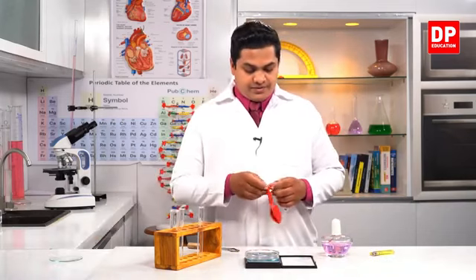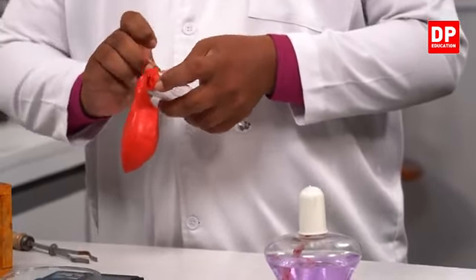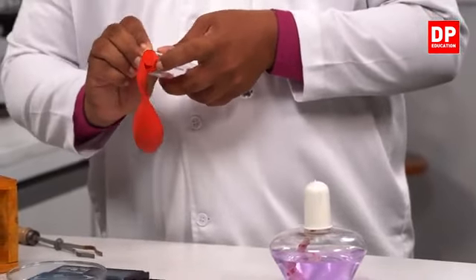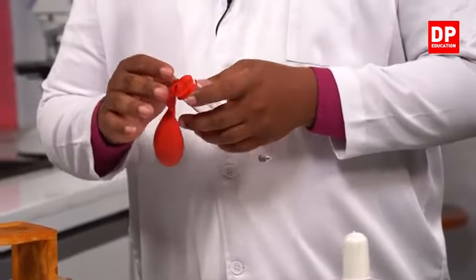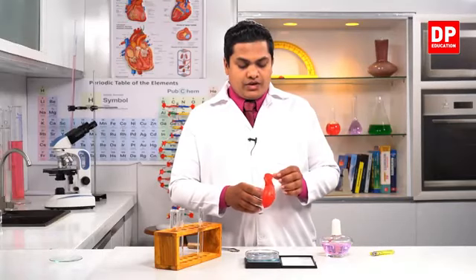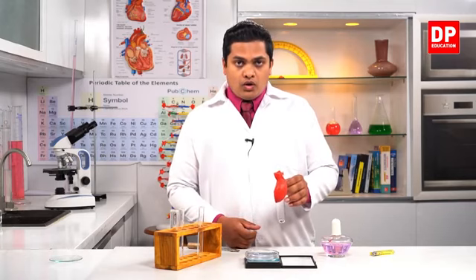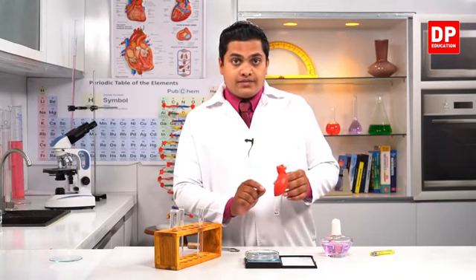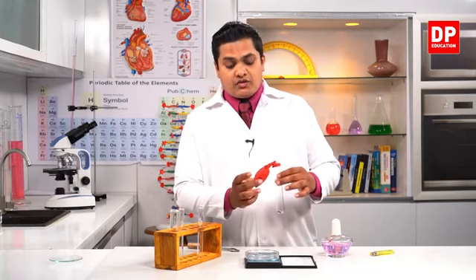Then I'm going to insert this balloon on the boiling tube like this, so that gases will not enter our system, and after burning these things, the gases created inside the system will not go outside either. So I have enclosed it.